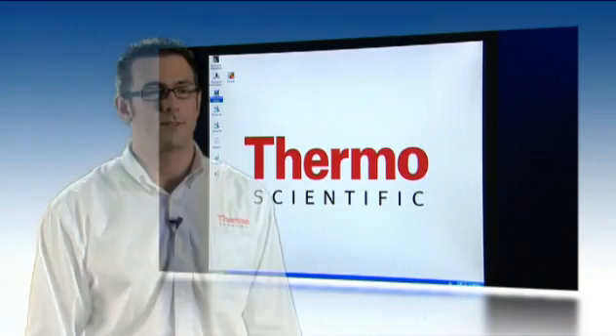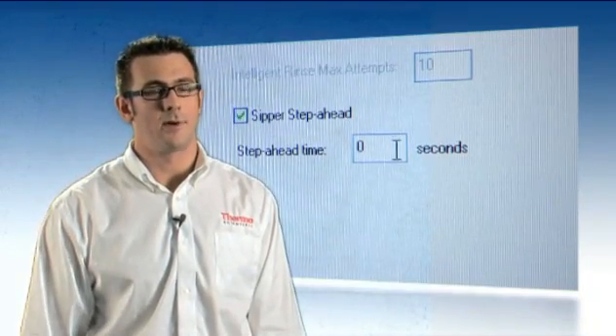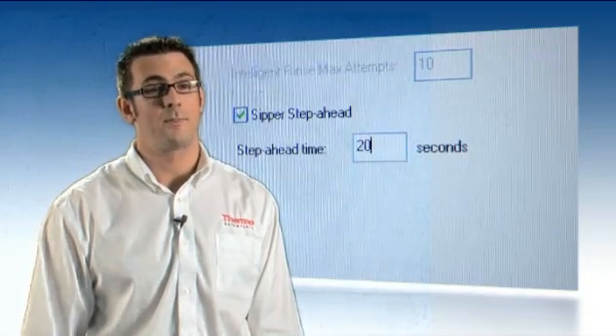All of these technologies and more combine in the iCAP 6000 series to give it some unparalleled detection limit capabilities. The iTEVA software suite has a number of intelligent features built into it, which really enables productivity to be increased by as much as 40% per sample.